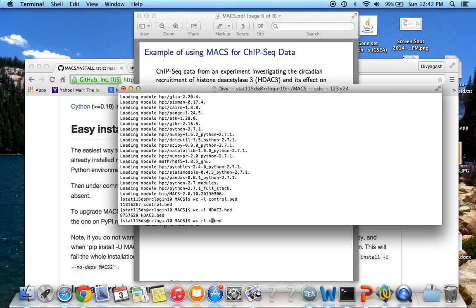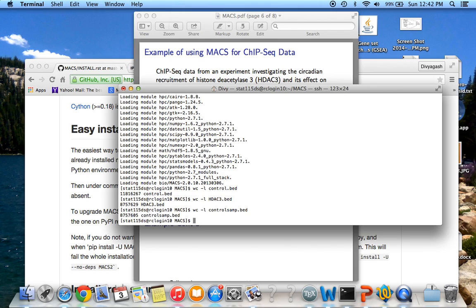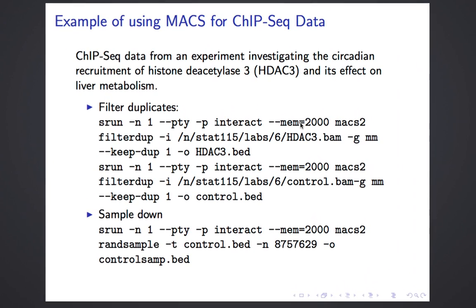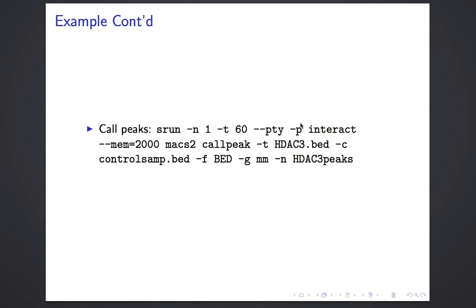After sampling down the control file, there are about 8.8 million reads. They might not be exactly the same, but we don't expect them to be exactly equal — it's fine if they are in the same ballpark. After doing those two steps, we are ready to call the peaks.